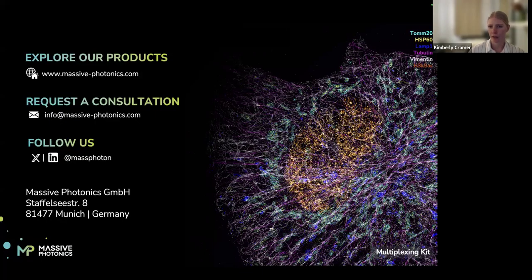Of course, if you want to make imaging faster, you could use 2 dyes at a time and 2 cameras. Then you could image, for example, Cy3B and Atto655 imagers at the same time, and this would make your multiplexing a lot faster. But there's not really a limit. It's not limited by the fluorescence dyes.